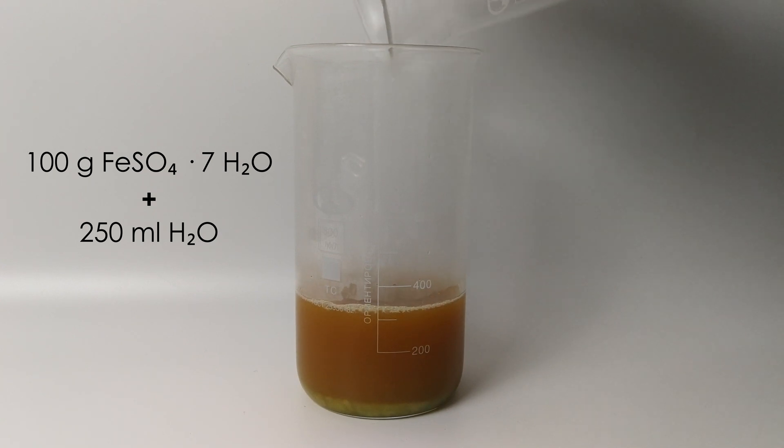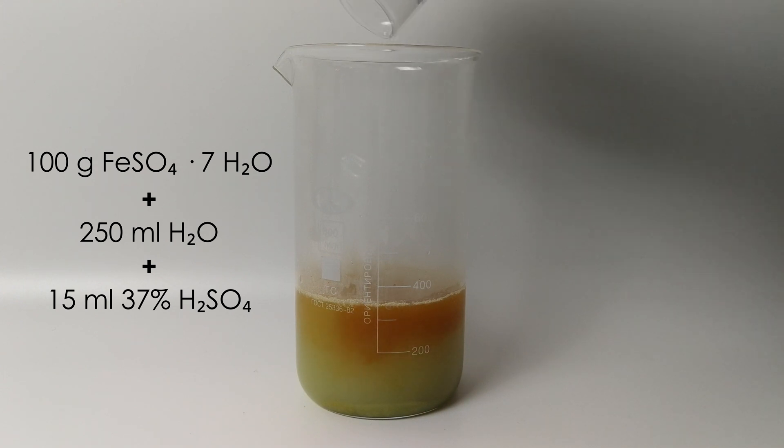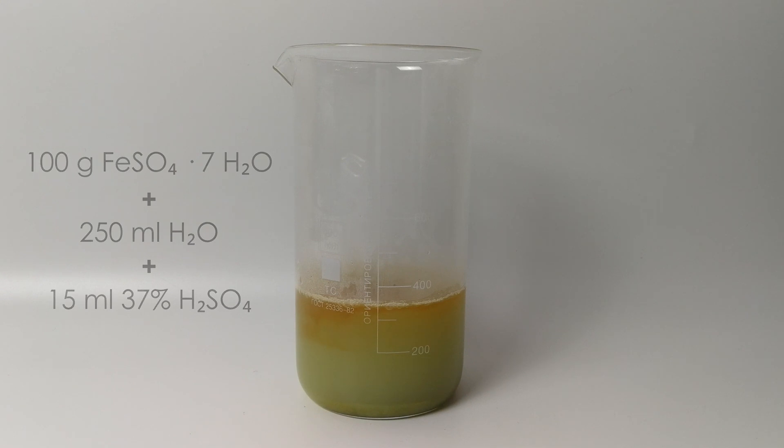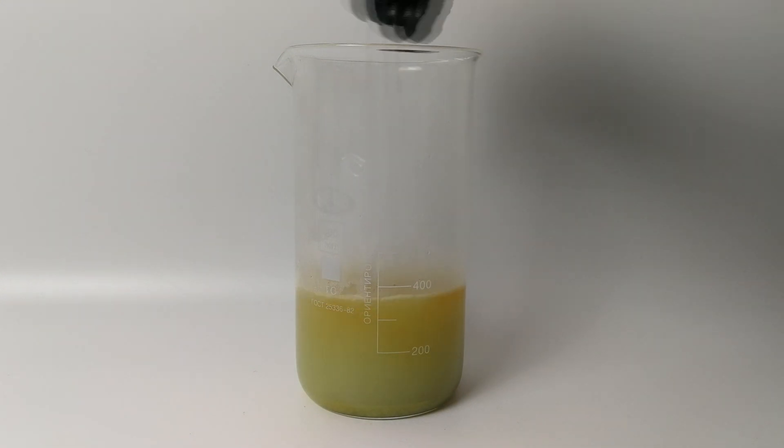The solution becomes murky brown due to a suspension of basic ferric sulfate. To dissolve it, we add 15 milliliters of 37% sulfuric acid. Overall, the concentration of ferric ions is quite low, and since they do not give a precipitate with oxalic acid, they won't interfere with our synthesis.